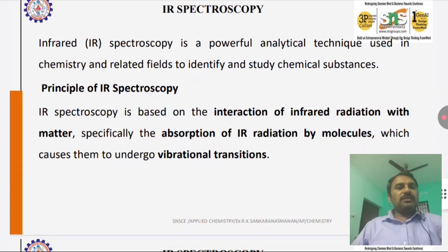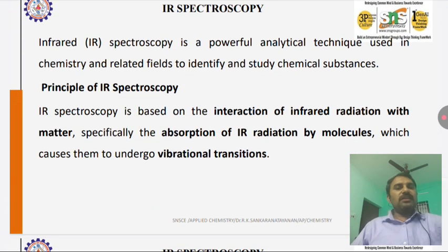First, what is infrared spectroscopy? Generally, we shortly call it IR spectroscopy. It's a very great technique to analyze materials and organic substances, and some inorganic substances. The principle of IR spectroscopy is mainly the interaction of infrared rays with matter, meaning some substance.